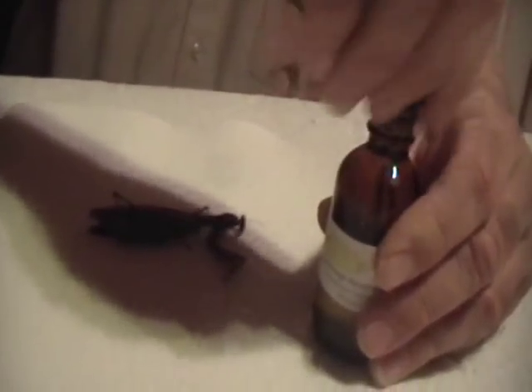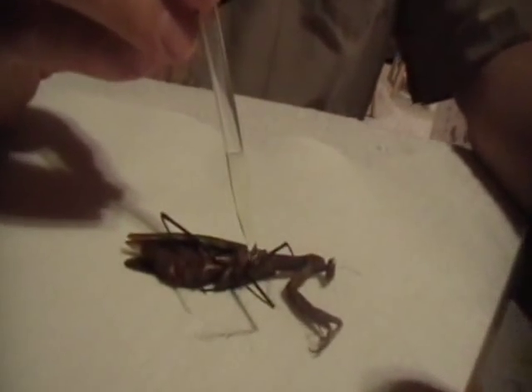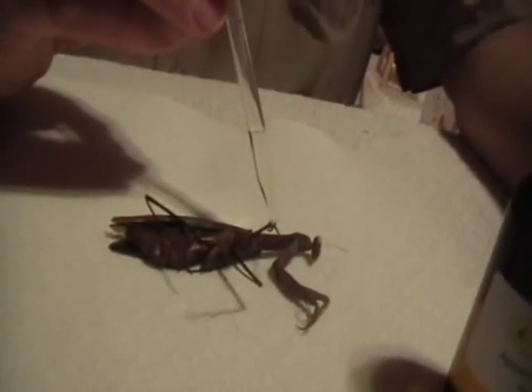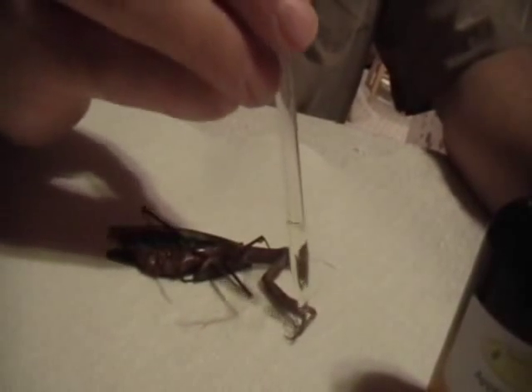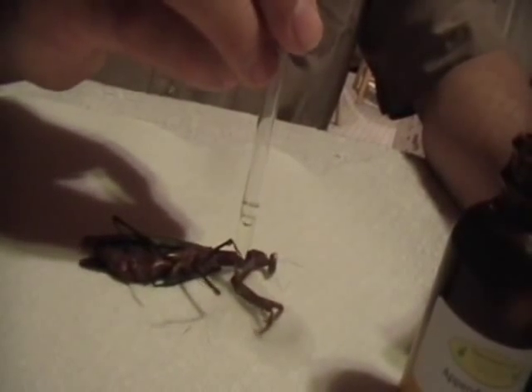It's real simple to use. It comes with a little eyedropper. And all you do is place the drops on the appendages at the joints — anything that might be easy to snap off. So I'm liberally applying it to the joints, and I'm even applying it to the antenna because I don't want the antenna to break.